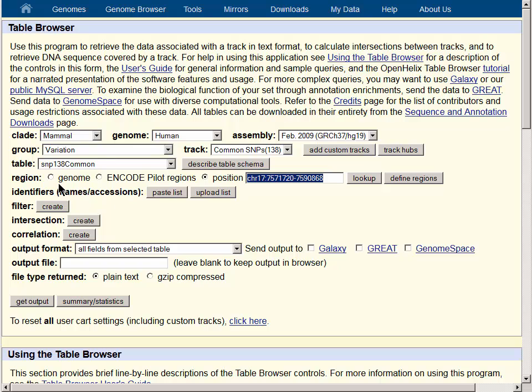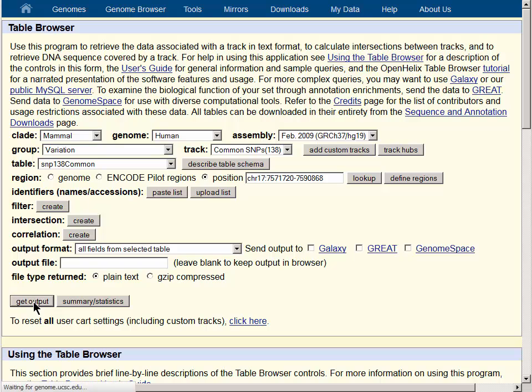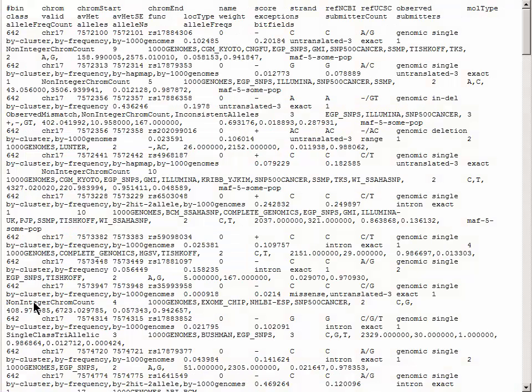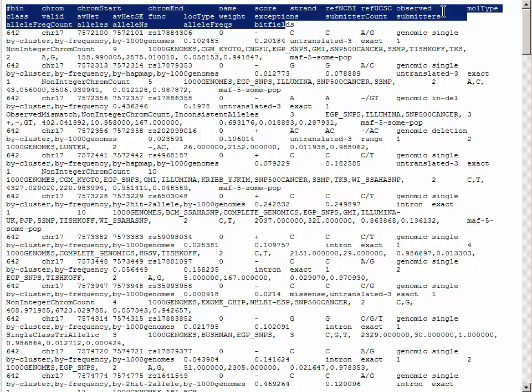If you use the whole genome option, which comes up by default, you will download a very large number of records and it may take quite a while. The output format, all fields from selected table, gives you a look at all of the data fields in the record, and the Get Output button takes you to a page that gives you all of the fields for the table you are looking at.